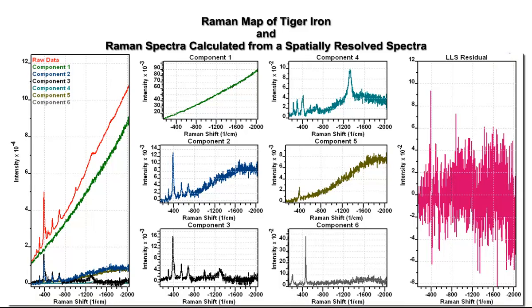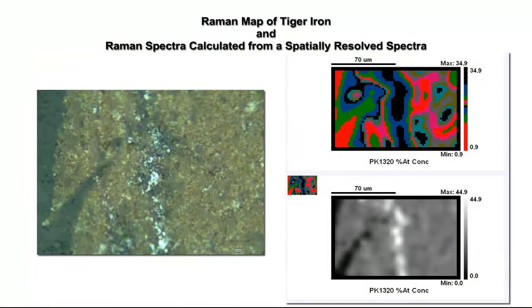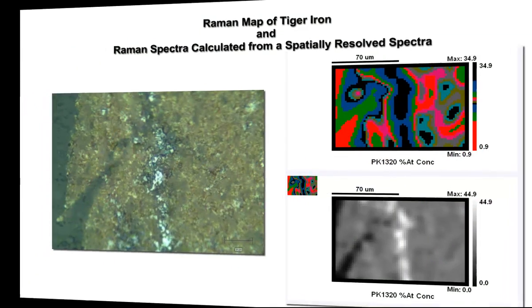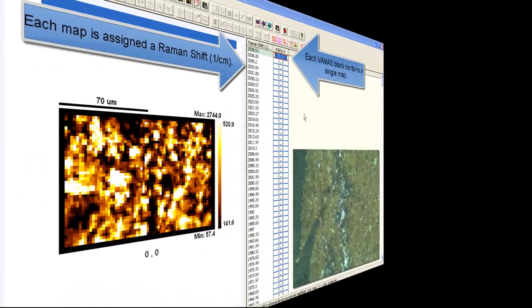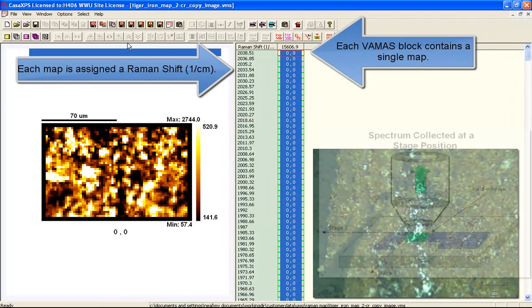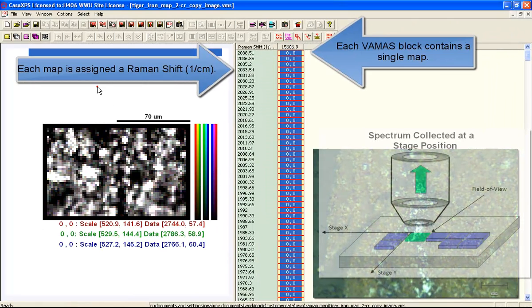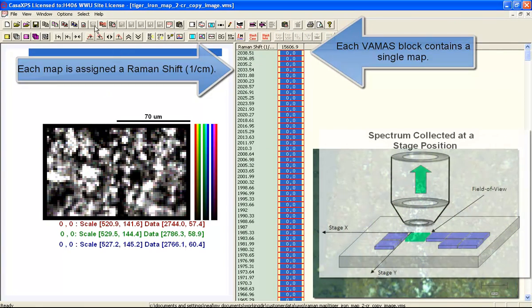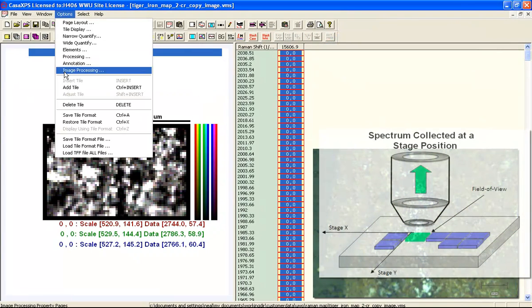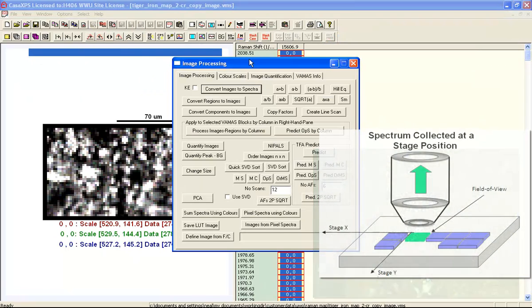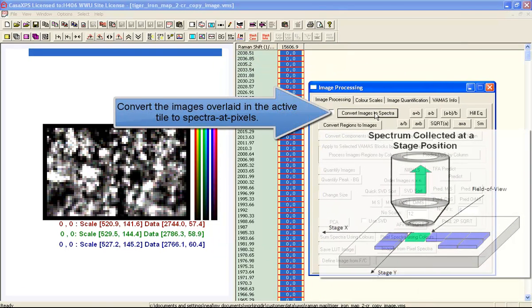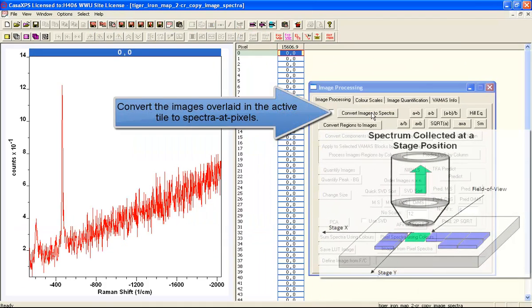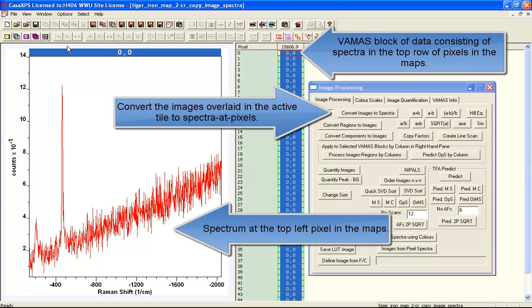A Raman map is acquired by collecting a sequence of spectra over an area of a sample and recording both the spectral intensities and the stage position as the map is performed. As a result, there's a relationship between a set of images and a set of spectra.